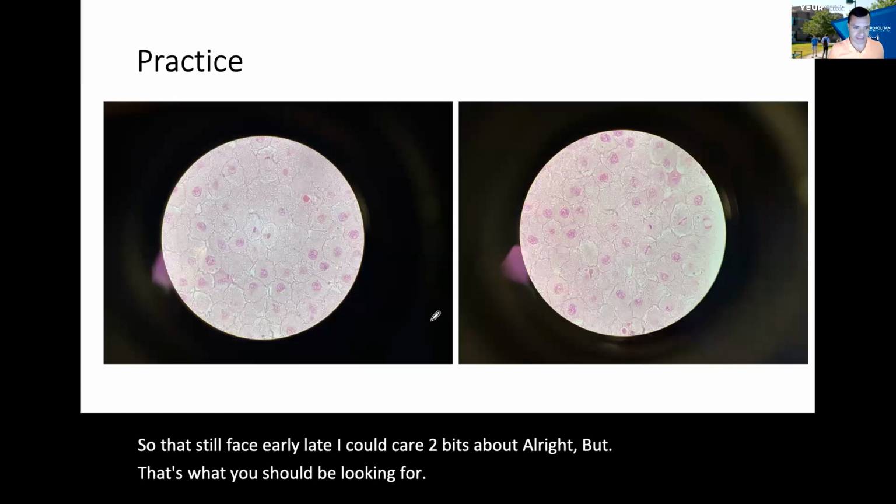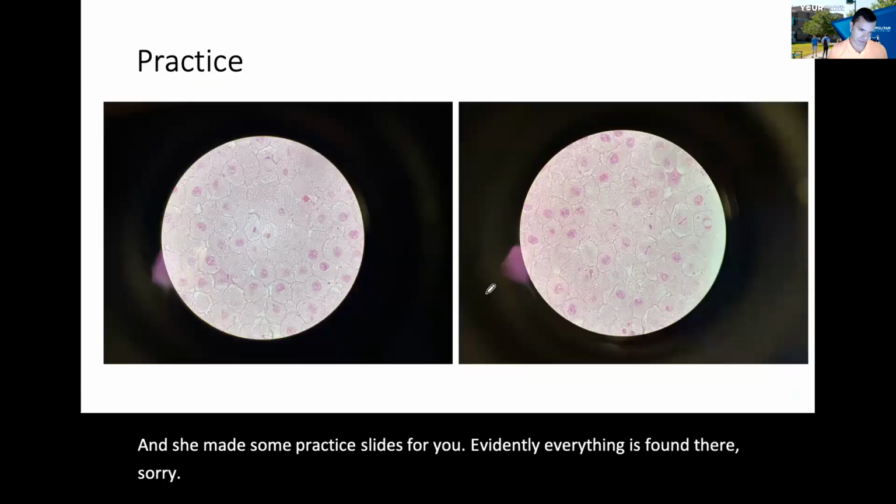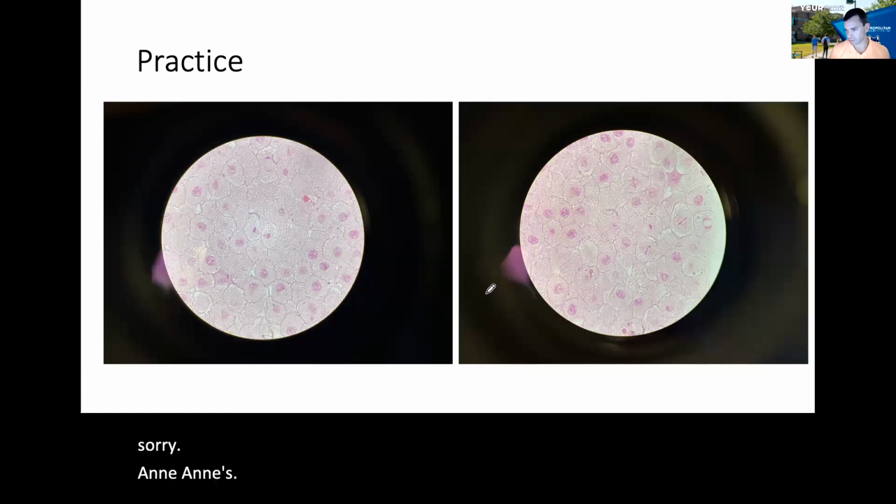She made some practice slides for you. Evidently, everything is found there: Ana, Meta, Telo, Pro, and Inter. And they're almost all there.